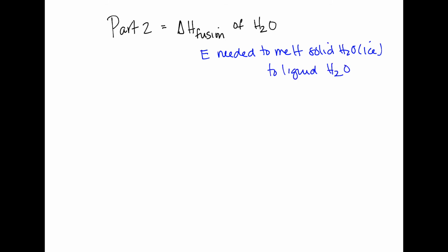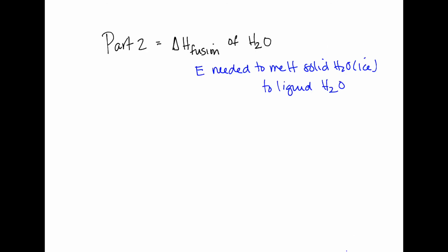Okay. And to think about what kind of data we're going to need, we're going to have to reach back to our thermochemistry equations and review a couple topics there so that we know what kind of data we need to be able to find this number. The first thing that I want us to remember is that anytime we have things in thermal equilibrium with each other, that means that they're touching and able to exchange energy.